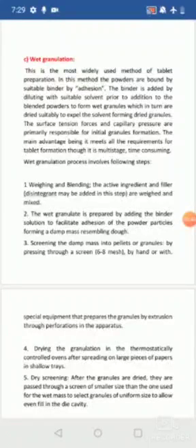Because here you are going to use the solvent, or the binder solution in the solvent form, it is known as wet granulation, or the adhesion method. Here you are going to bind the particles with the help of the binder or the adhesive. So you prepare the wet granules, and after that you dry those granules in the tray dryer or any dryer to remove the solvent.